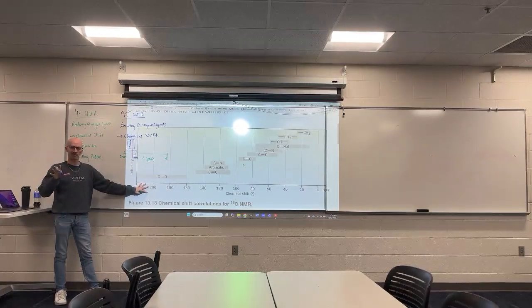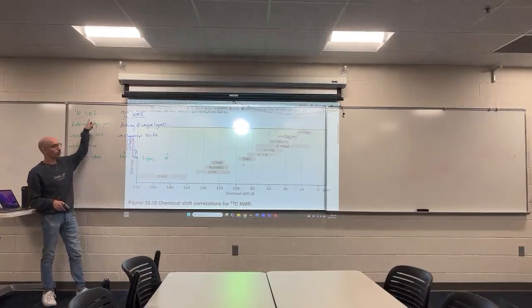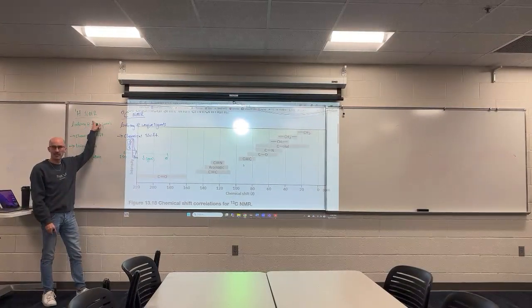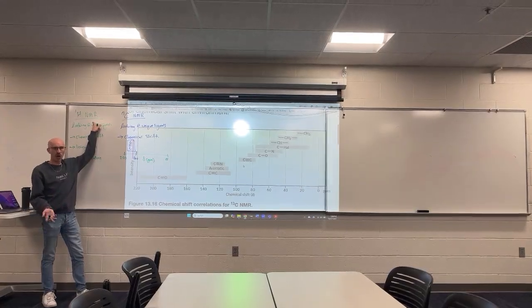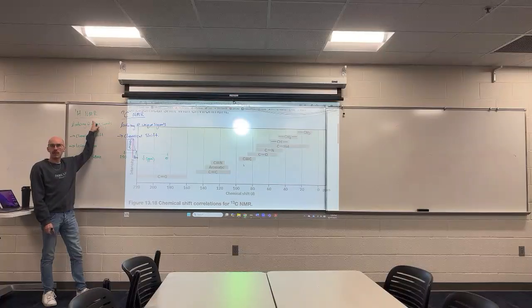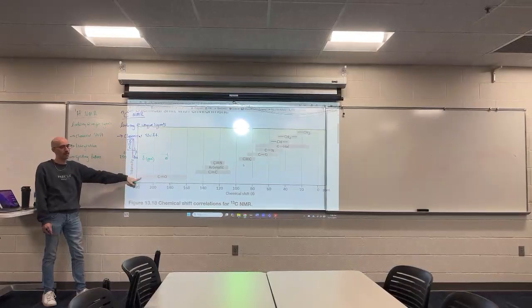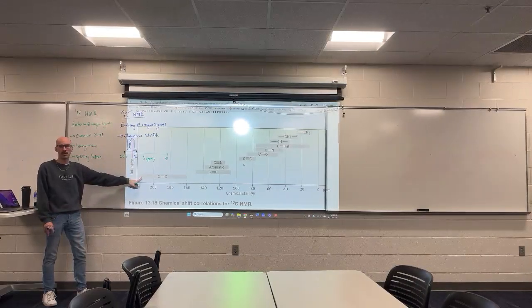With proton NMR, it's very challenging to prove that there's a carbonyl, because carbonyl carbons don't always have hydrogens attached to them, and proton NMR only looks at the hydrogens. If you had an aldehyde signal or a carboxylic acid signal in the proton NMR, well, there's a corresponding carbonyl. But if there's a ketone, ketones don't have hydrogens attached to that carbon. If there's an ester, there's no protons attached to that carbonyl carbon. Carbon NMR will tell you if there's a carbonyl or not.